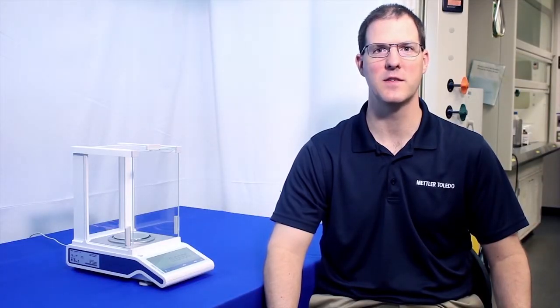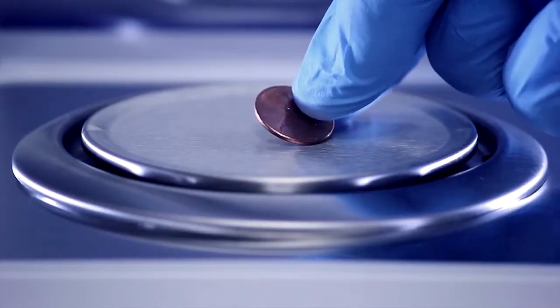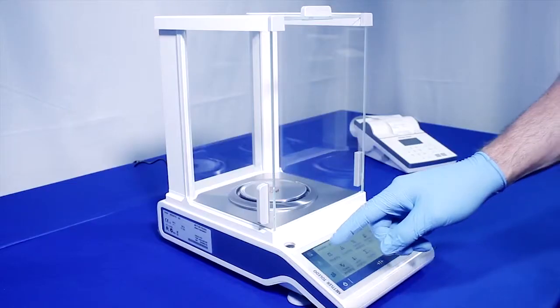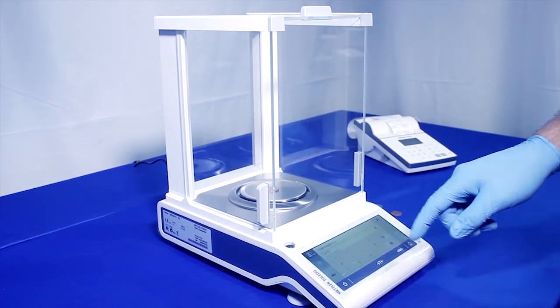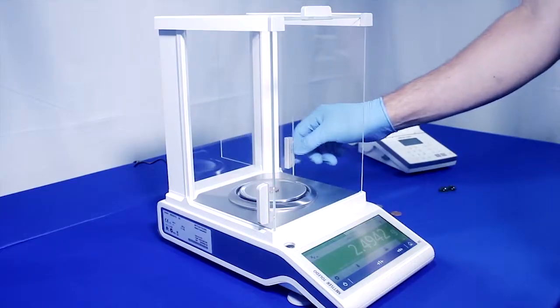As for weighing, there are 12 built-in applications that provide straightforward user guidance. The check weighing application allows you to enter a target weight and a desired tolerance for your item. The balance displays a green color indicator when you've reached the target value.